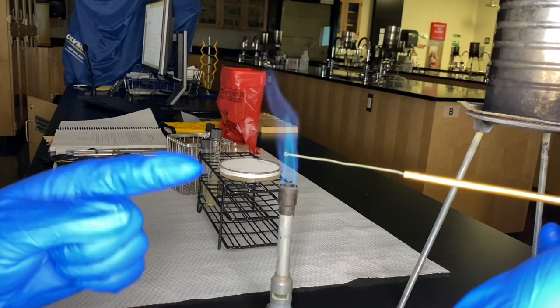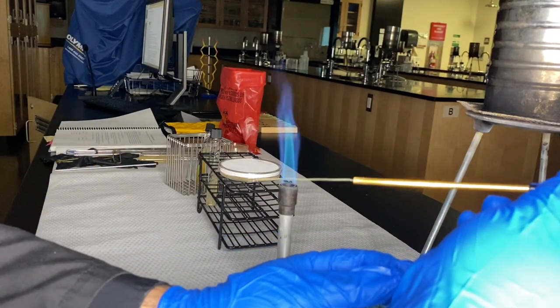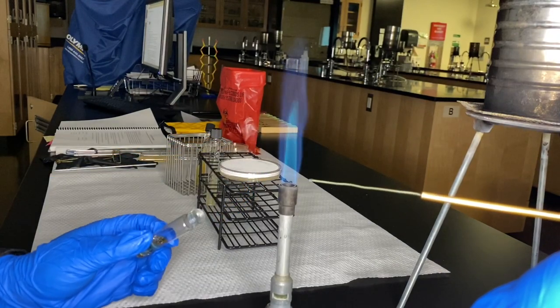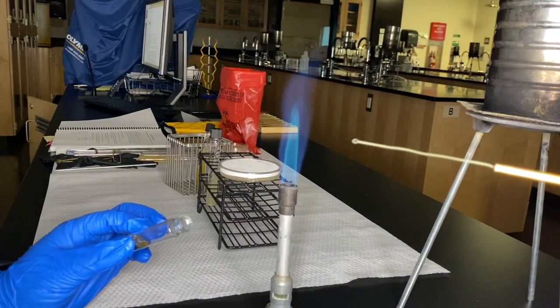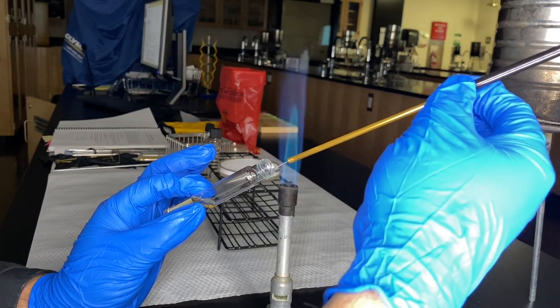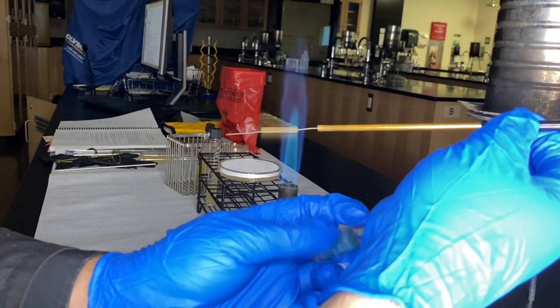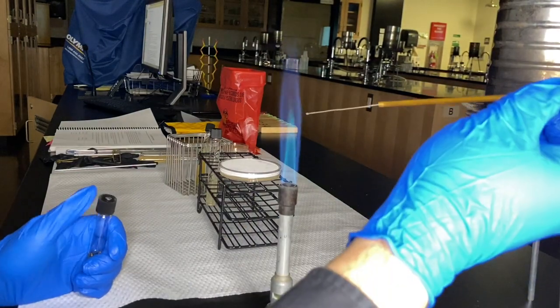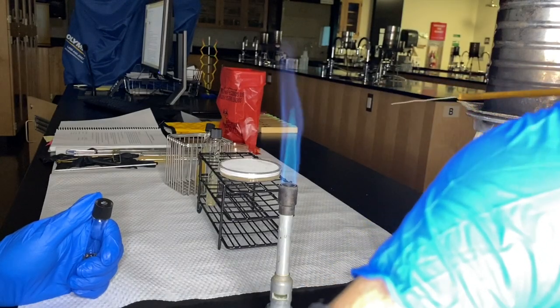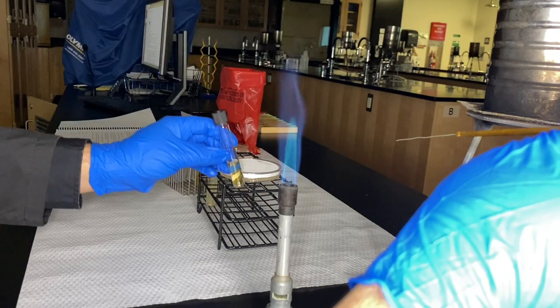Now I need to transfer to my first destination: the broth. Same idea — pinky technique to open it, a quick sterilization of the opening, and then just shake the loop around a little bit in the broth. Sterilize again, use the pinky technique to close it, and incinerate whatever's left on the loop. This tube has now been inoculated.